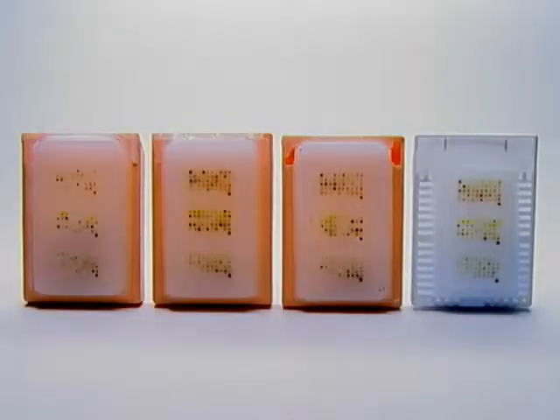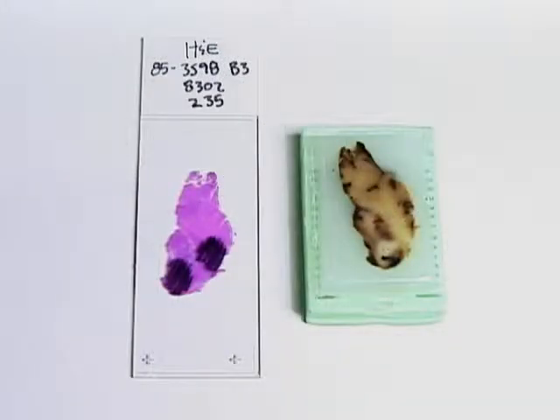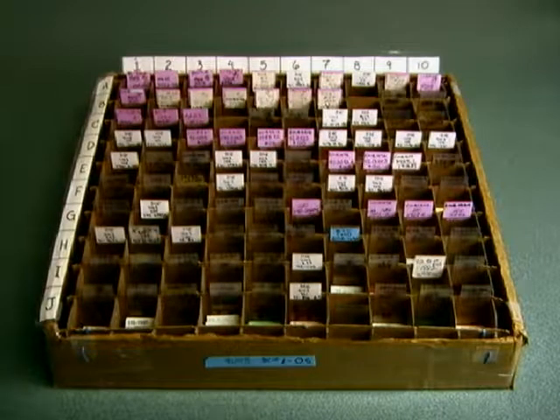Some protocols require a random sampling of donor tissues to get a true representation of donor blocks. To do this, three or four array blocks are constructed from the same grid paper. A fresh H&E is made from the specimen blocks. The positive areas are marked with an indelible pen. With the corresponding block and slide placed together in the grid box, according to the grid paper layout, you are ready to begin punching.